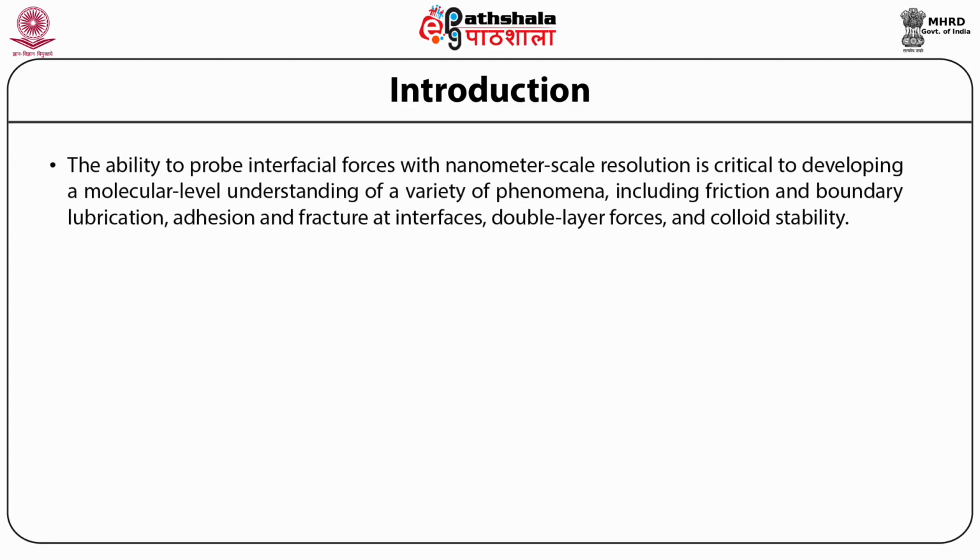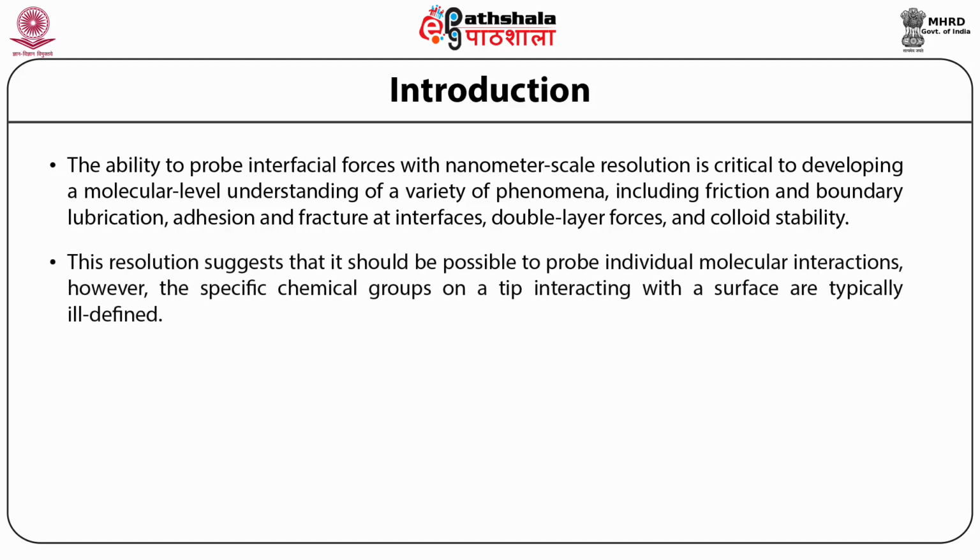The ability to probe interfacial forces with nanometer scale resolution is critical to developing a molecular level understanding of a variety of phenomena, including friction and boundary lubrication, adhesion and fracture at interfaces, double layer forces, and colloid stability. Significantly, the absolute force resolution in AFM can be several orders of magnitude better than the weakest chemical bond. The resolution suggests that it should be possible to probe individual molecular interactions.